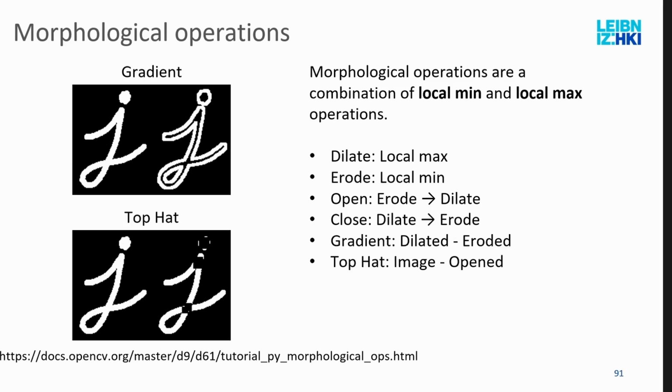They tend to usually smoothen out angled features in the images. And then ones that are useful, here this morphological gradient. For example, if you want to make a quick outline, or you want to just focus on the border of the image, so turn it to the border of the image. There are actually different gradient operations that are a bit different, like internal gradient and outer gradient, but they're all different variants of that. And then top hat, if you look at it online, then this is absolutely not useful at all. But you have seen what it does.